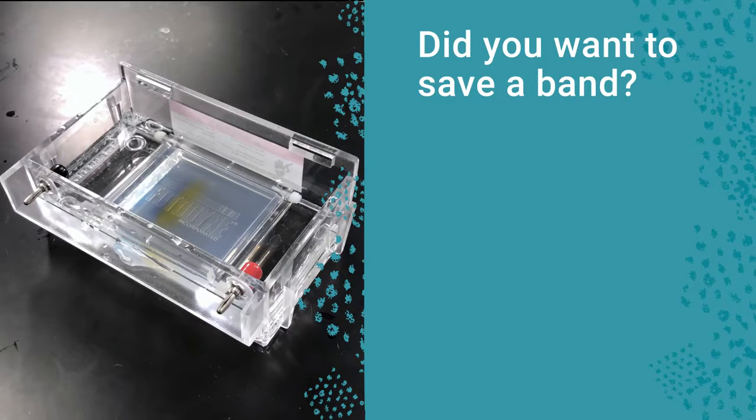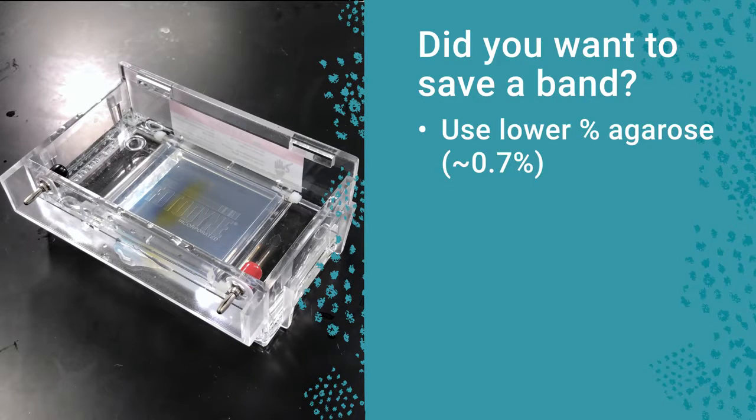After you've run the gel, you may want to cut out a band for DNA purification. If this is your goal, be sure to use a lower percent agarose gel, like 0.7%.